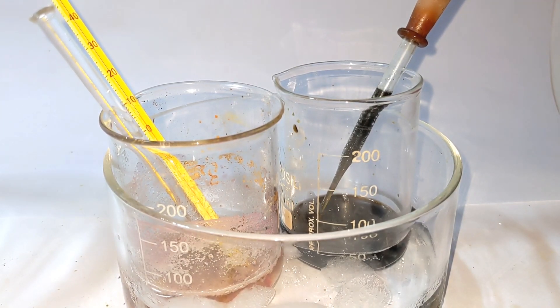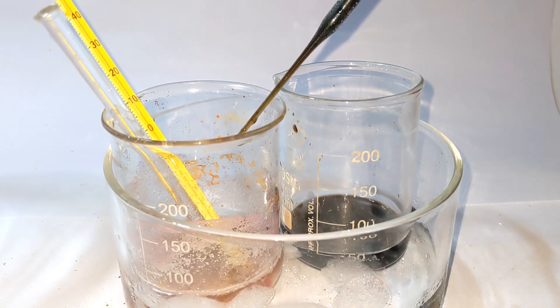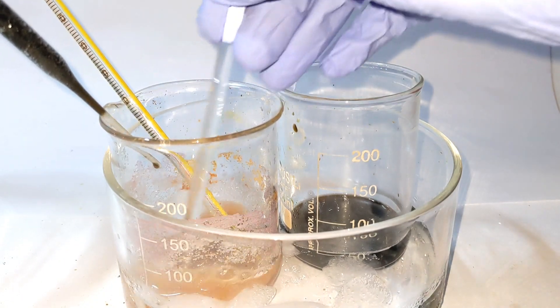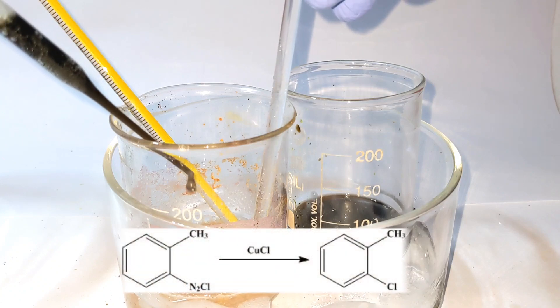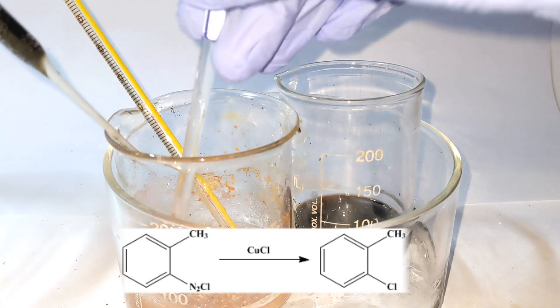Now the chilled cuprous chloride in hydrochloric acid solution was added to the diazonium solution. Once the whole cuprous chloride solution is added, a lot of solid substance is formed and the mixture becomes viscous. This is due to the formation of addition products.